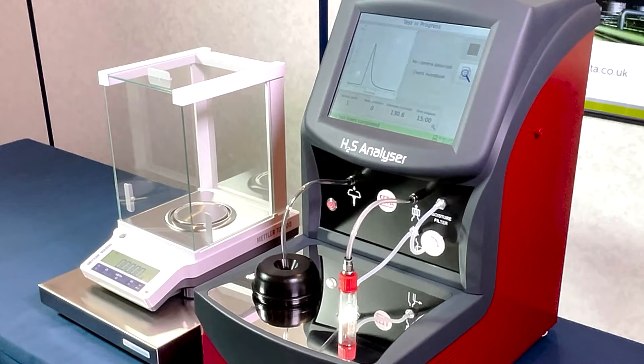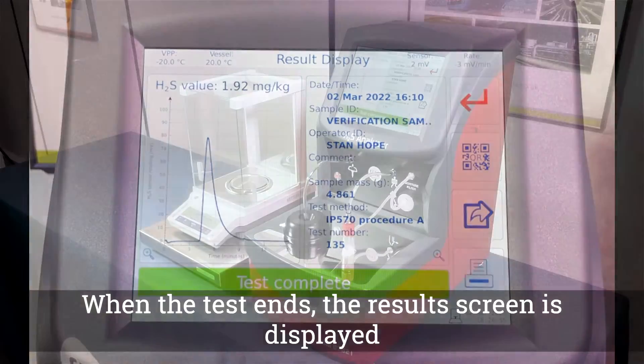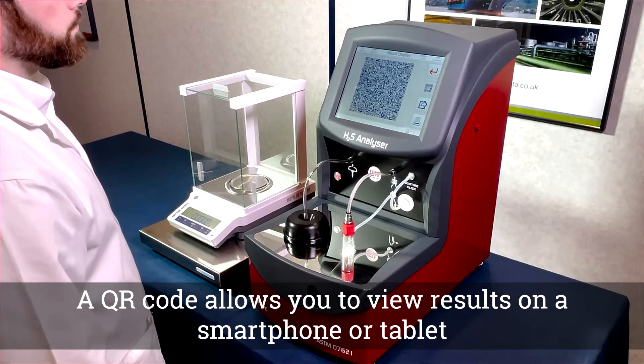At the end of the test, the pressure is released from the system and the results are then displayed. Recorded data can be exported in a range of formats.